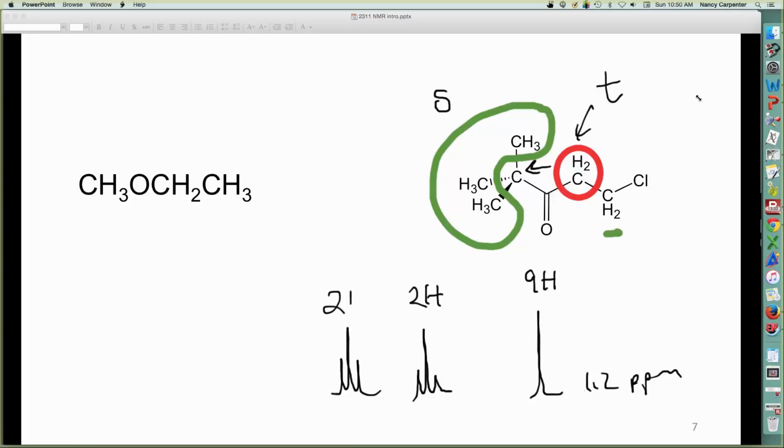But so we'll have 2 two hydrogen triplets. And since we have our IR as well, yay, we know there's a ketone in there, so we can piece everything together and figure out just exactly what molecule we have. Much, much more information than a melting point, boiling point, or TLC Rf.